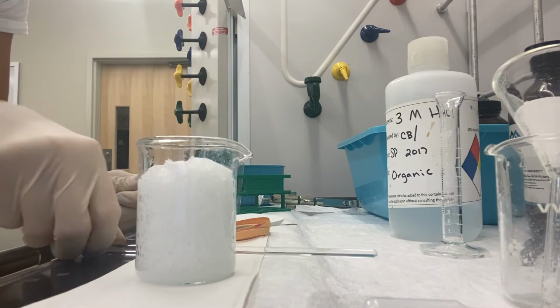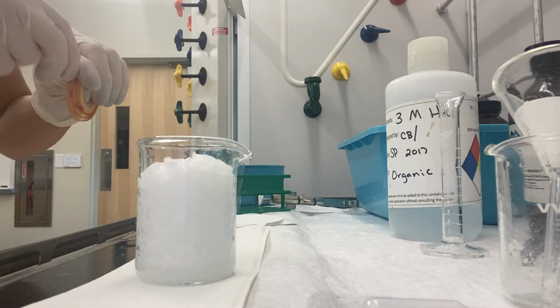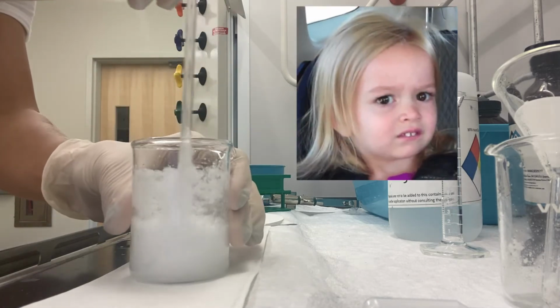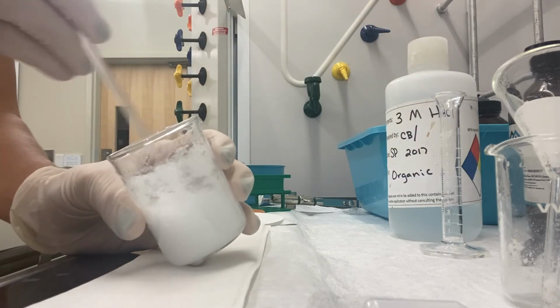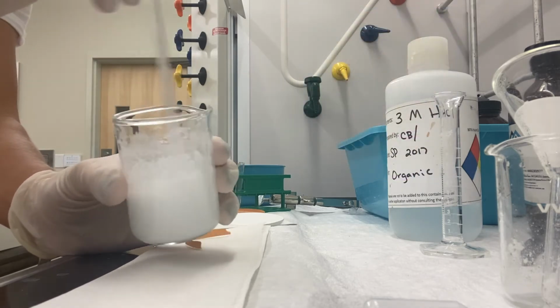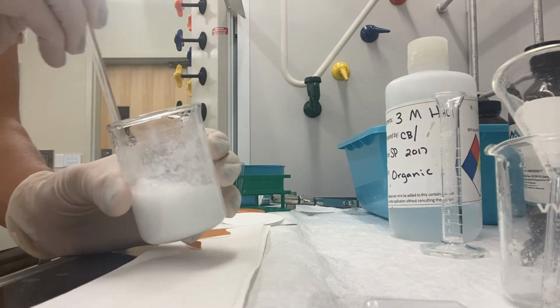Okay. So I've added all 8 milliliters at this point, and we want to give it a stir. I'm going to use my glass stirring rod. Make sure our pH is below 3.